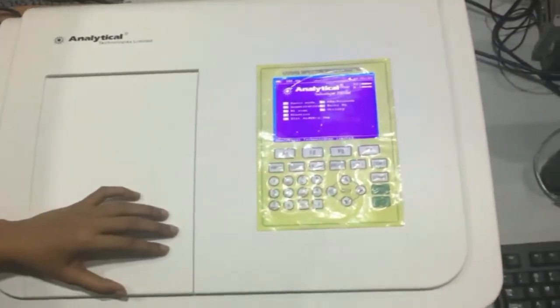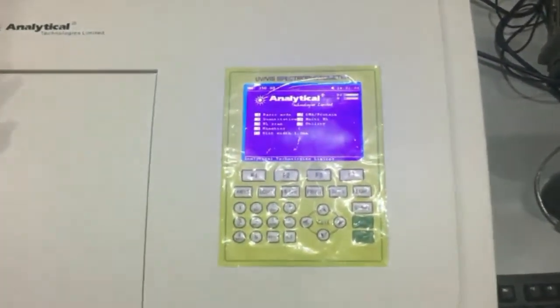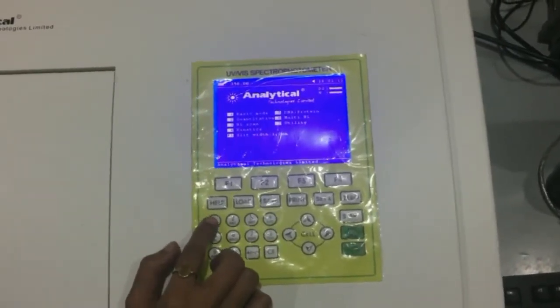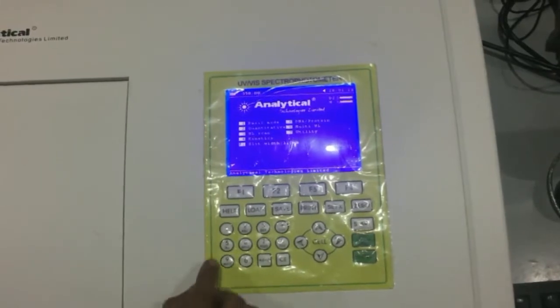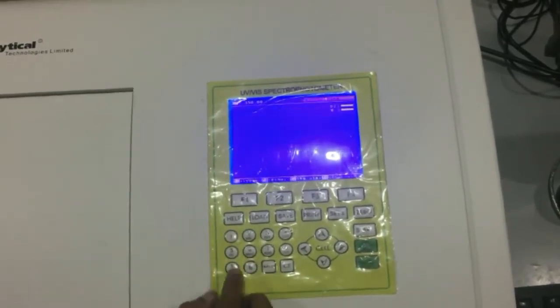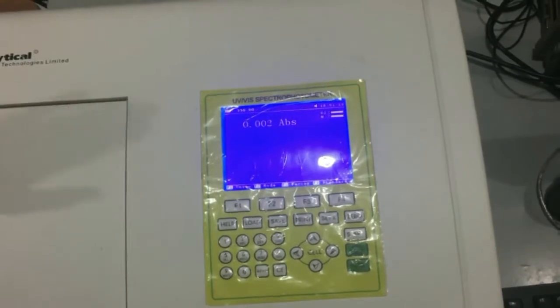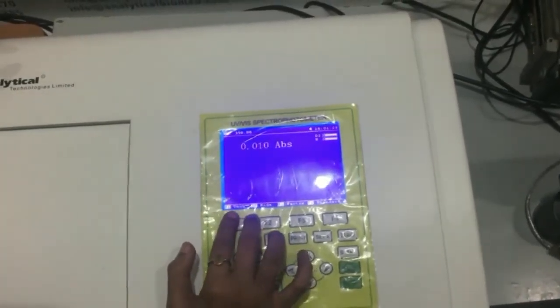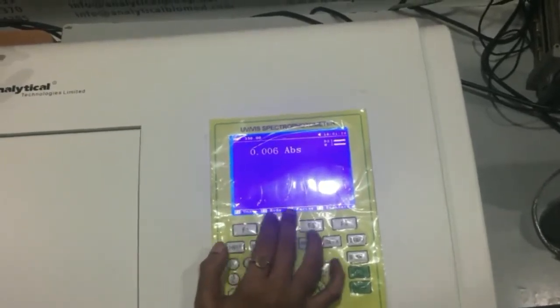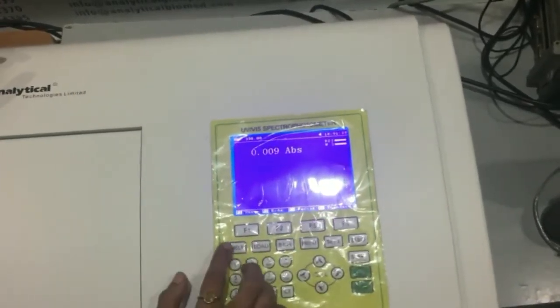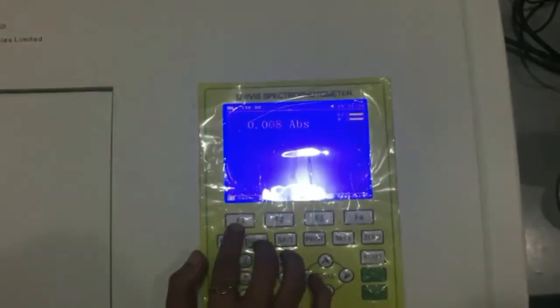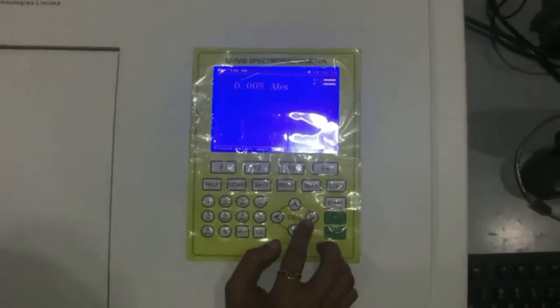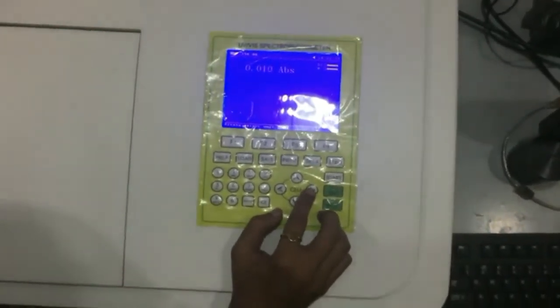After closing the sample window for analysis, in basic mode you need to go with option one for basic mode operation, where you can find options to change unit mode, factor, and standard. To change the unit you need to press F1, where you can change the unit of measurement of the sample as per your requirement.